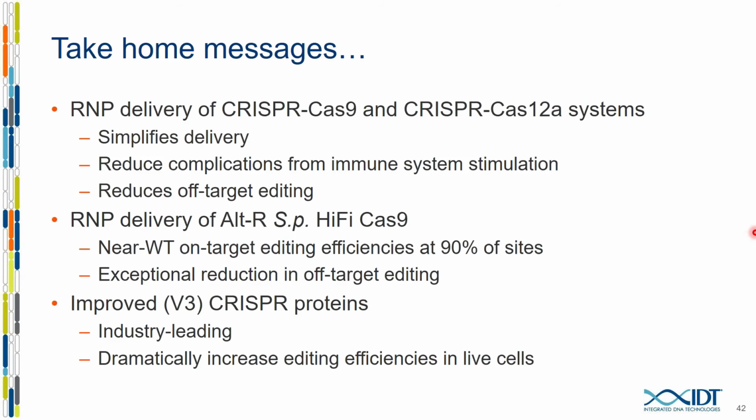And because there's a lot of development that goes into even reproducing things that happen in the literature, we put our effort into GuideSeq, and we found what worked for us internally, and we just kind of stuck with it and incorporated it into what we thought is the best overall approach to look at off-target editing. So I think any of those different methods, CircleSeq, Genome-seq, what have you, could all be used and produce similar results.